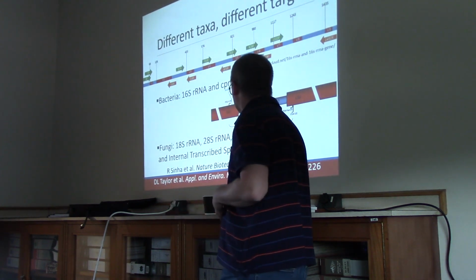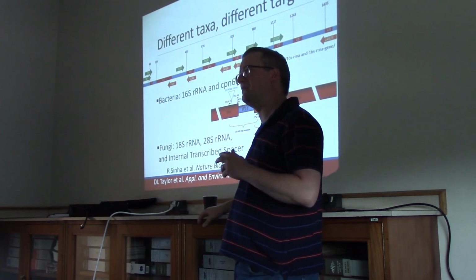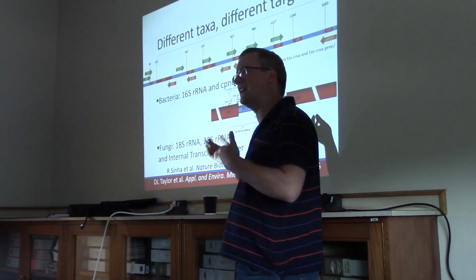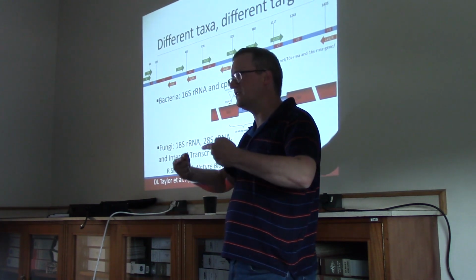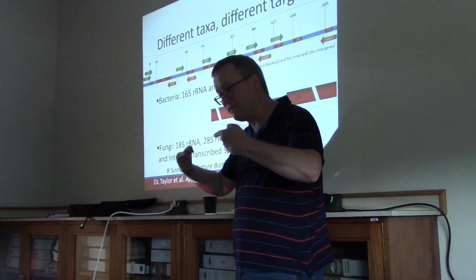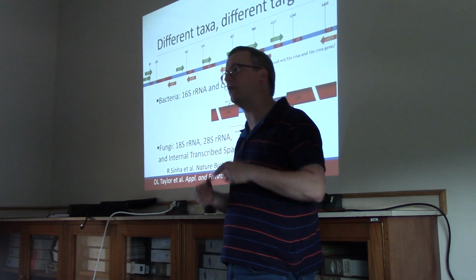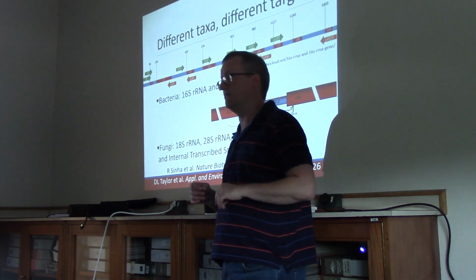So they are using the ITS regions as variable regions that are very useful for determining which specific species of fungus is present. Okay, so I hope that this little discussion has helped us to think about some of the biology that we're trying to get at. We need constant regions flanking because we want primers to stick in the first place, and we want variable regions between them that give us enough variation for us to pick out which species this bug is.